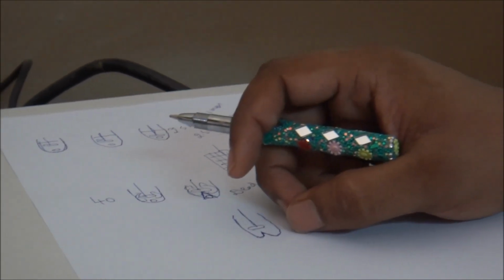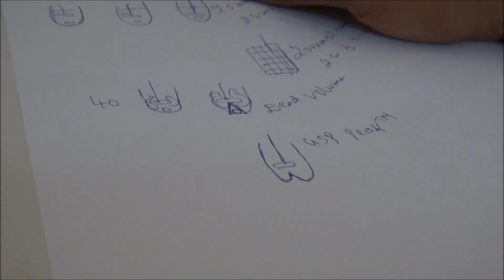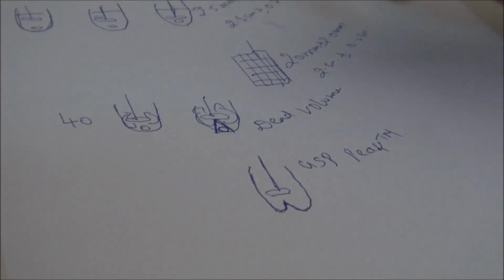Now, 40 mm height is not at all suggested by USP. As we discussed, the USP peak vessel is not an official apparatus, but a trademark used by formulation R&D people just to know whether there is a coning effect during dissolution study or not. And as I also said, the coning effect is not common in all types of solvents. It varies with the composition of buffers that we add to the solvent system. A little increase in viscosity can add more coning effect. So you have to check whether there is coning or not.